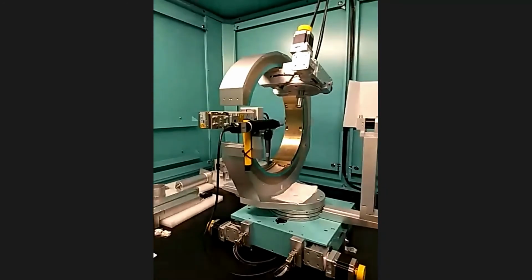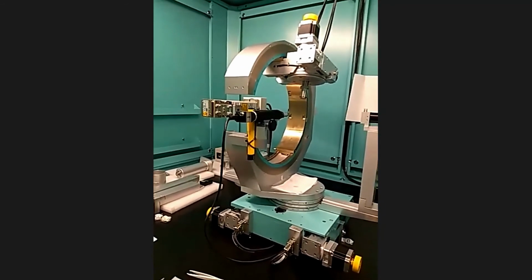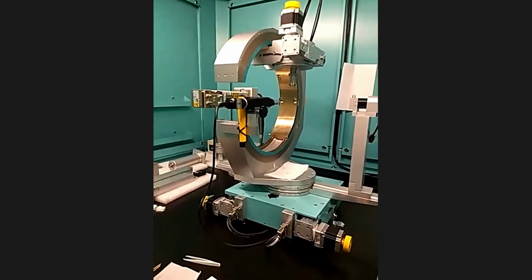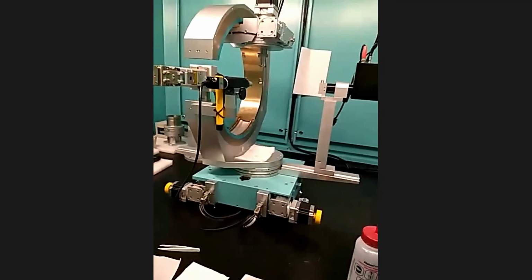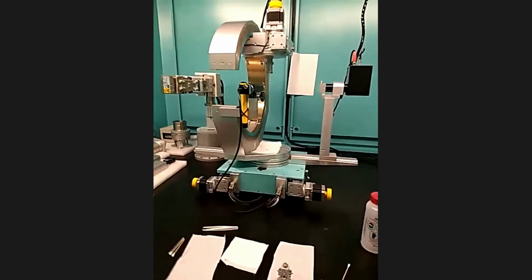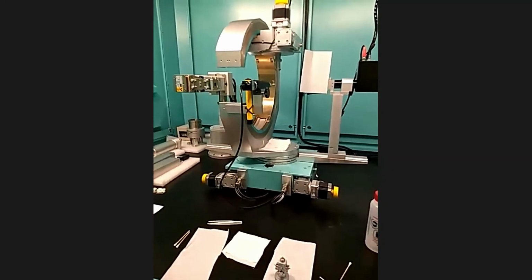But it can be a single crystal, which is grown in a different way, not using PLD. There are different procedures, and one can do a whole PhD on how to grow single crystals. The famous single crystal growers are very big guys in the field. But the single crystals have little domains. I need to explain things. So they have little domains.